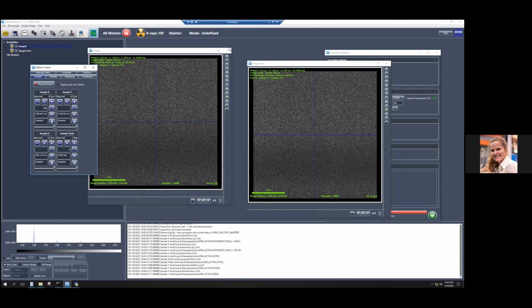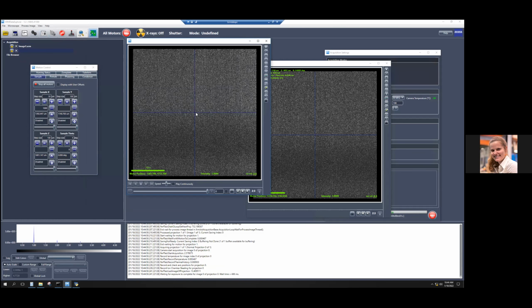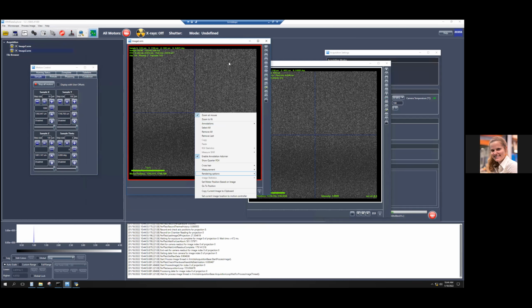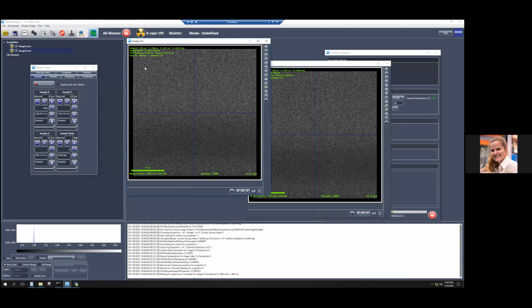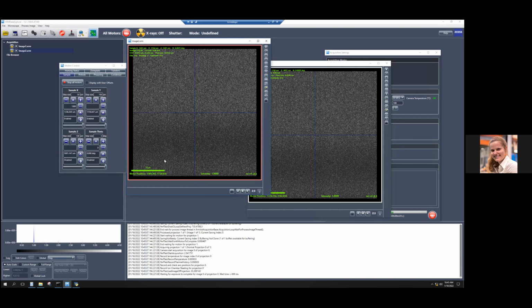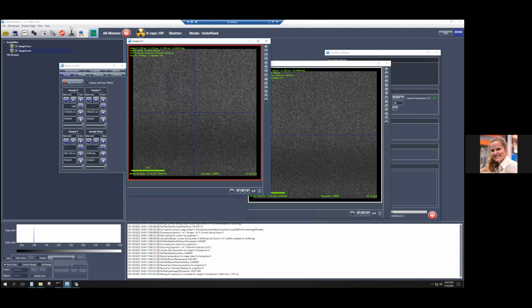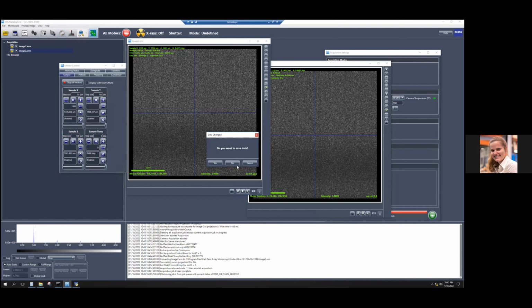Okay. Other things, if you want to move the sample and you're doing continuous imaging, instead of right clicking, which you can still do, you can also double click anywhere. It's obviously not going to be very interesting, but if you double click, you can see on, for example, the motion control that it actually moves X and Y. That's a good way to move around your sample as you're looking at your sample. Obviously, really boring right now. Hit stop. Close that window.